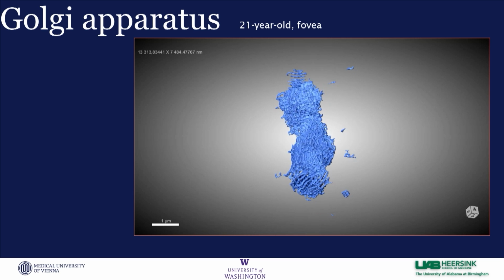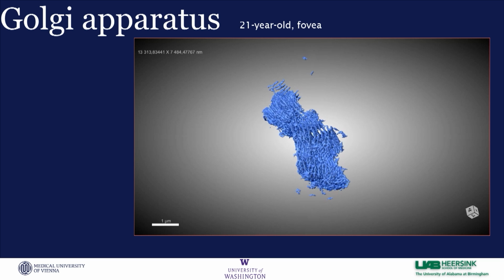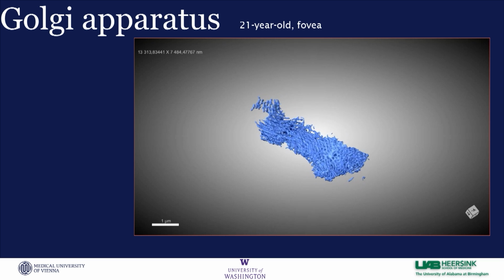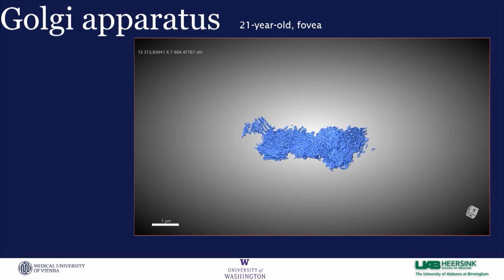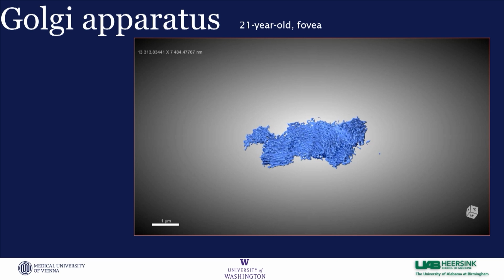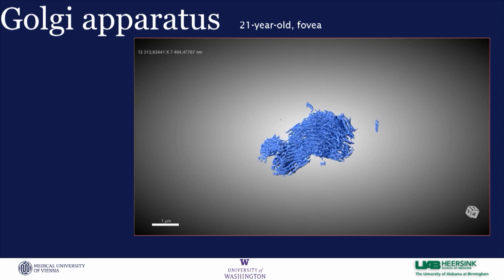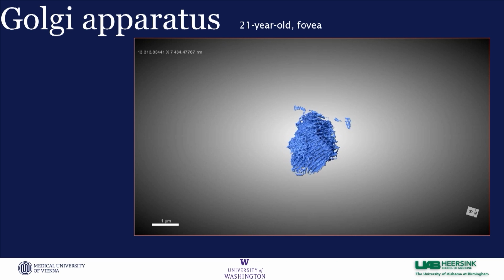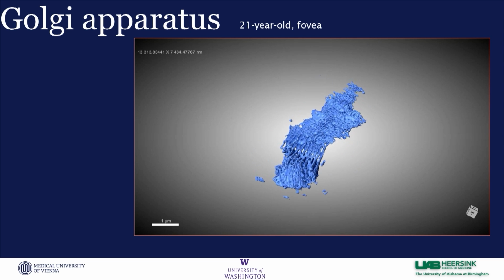And often in the textbooks, it's a very planar example where a protein, or a vesicle, comes from one side and passes through and goes out. But this structure, if we look at it, it's almost twisted. So it's almost like it doesn't matter where the protein enters, it can always be calibrated to go to the right destination. I don't know, that's just my theory from segmenting this, but we weren't expecting it to work this well, but it did quite well.